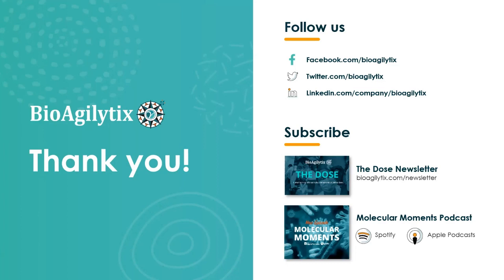That's a good question as well. I think it depends on how your method is performing during method development, and as you're optimizing the assay, really understanding how your precision and accuracy look in method development should drive what acceptance criteria you're going to use in your validation. Throughout the presentation, I gave some recommendations for what acceptable criteria could look like for molecular assays.